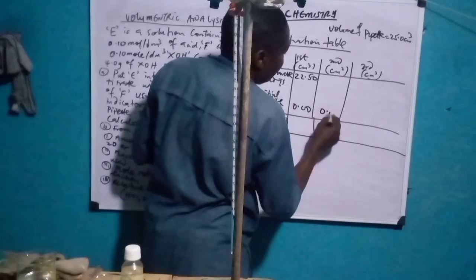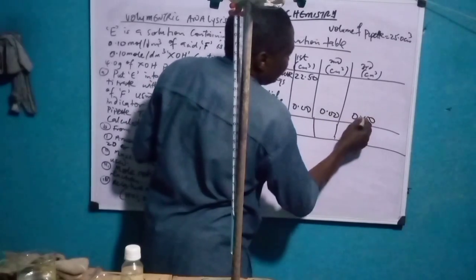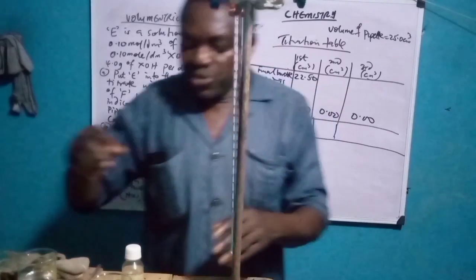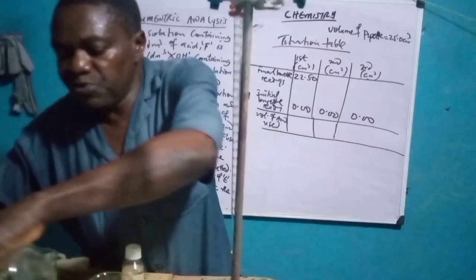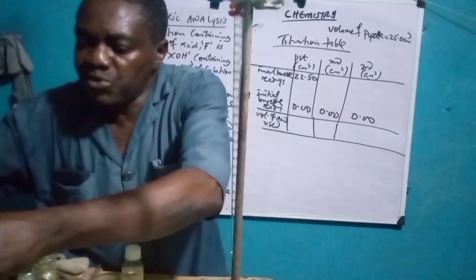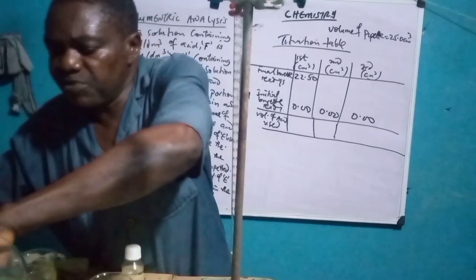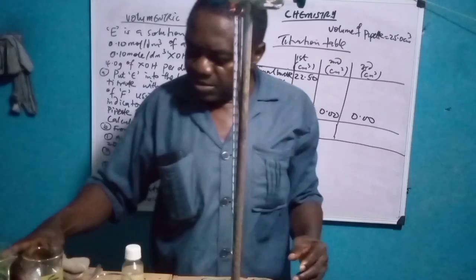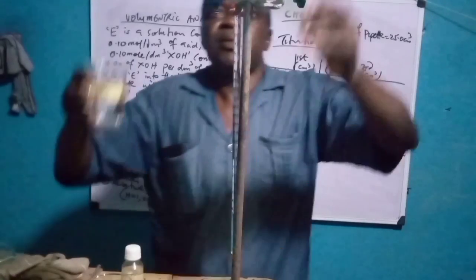We are starting from 0. Since you have enough solution, we just make all of them 0. Remember in the first video, I told you how to do it, even if your solution is not enough, how you can start from where the previous one stopped. Please go through it very, very well. So let us top it again.